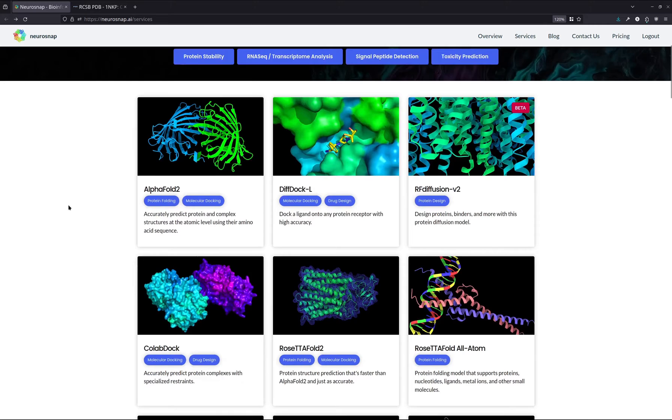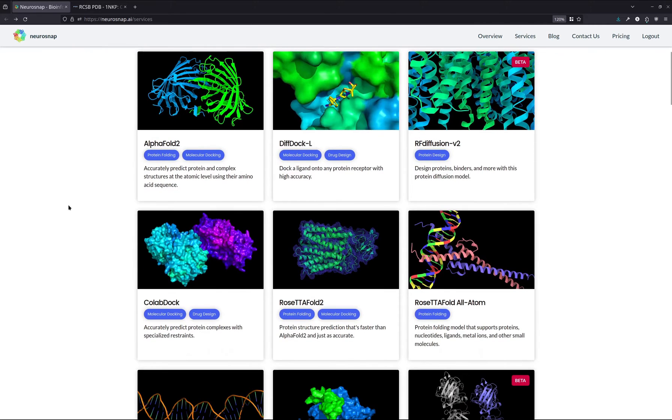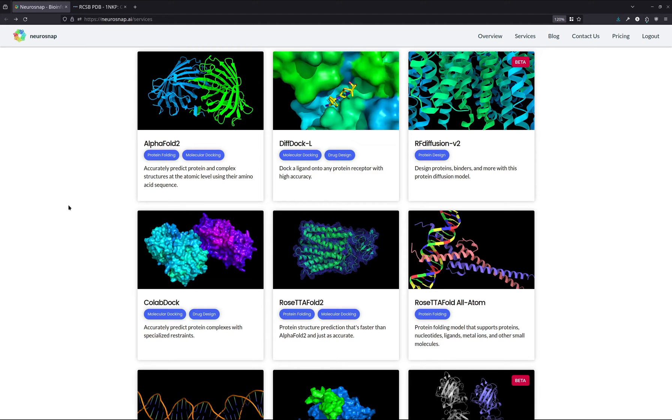For those of you who aren't familiar with the Neurosnap platform, it's essentially a website where you can go and access all these different bioinformatic tools and models very easily and without any technical experience or coding experience. For those of you who are academics or in industry, this is a really great way to get started with these tools and models without actually having to deal with the hassles of getting started with bioinformatics.